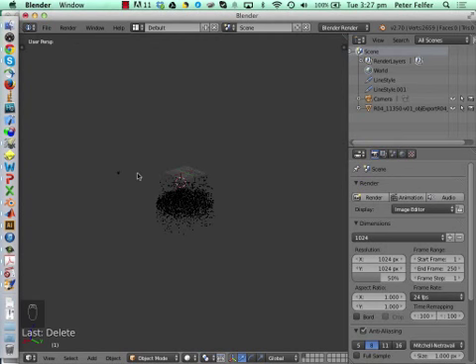Alright, so who's got problems with loading data in, and what is the issue? Okay, Barbara. Okay, so something's not quite right with the file. Okay, has someone done it successfully? So Anna, you've got the data in Blender now. Okay. So the exports, there's nothing wrong with the export script. I just have no idea what went wrong with Barbara.